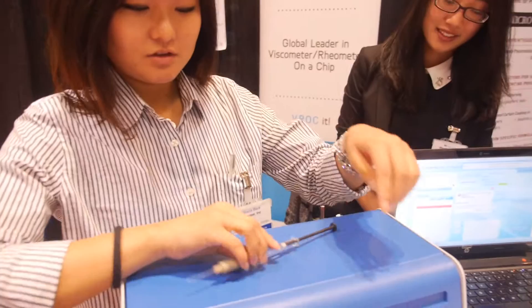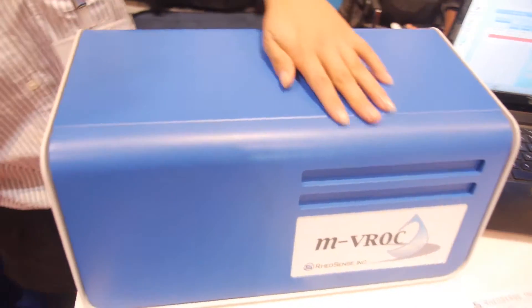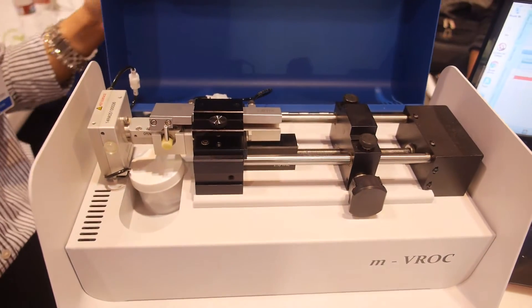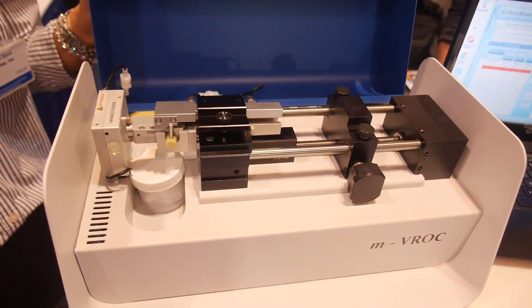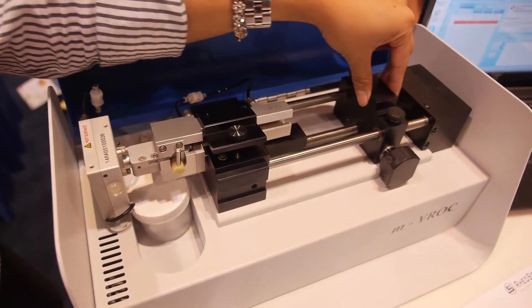So what are you showing here? This is one of our instruments — this is the m-VROC viscometer, known for its small samples and accuracy. This is more of a lab bench and R&D instrumentation and it's controlled by a pump system.